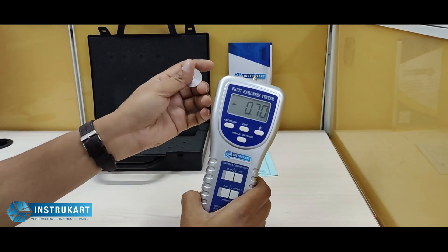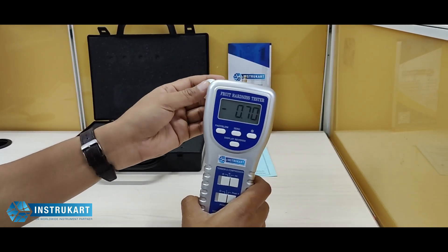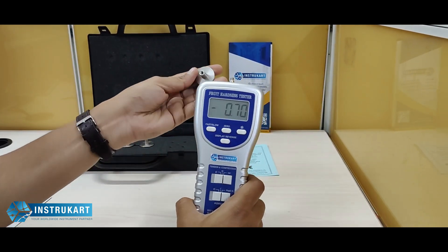The pressure of the dynamometer can be defined in units such as Newton, kg, or pound, and the area of the pressure can be in centimeter square.